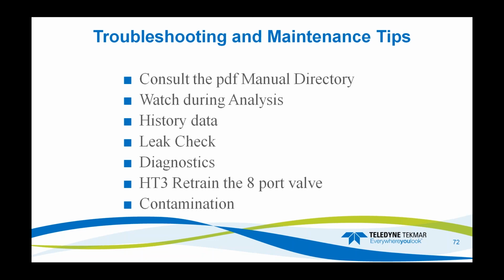Sometimes with the HT3, the 8-port valve can get untrained, so we have to retrain that. And sometimes there may be contamination in the system. So I want to cover all of these for doing maintenance on the systems.